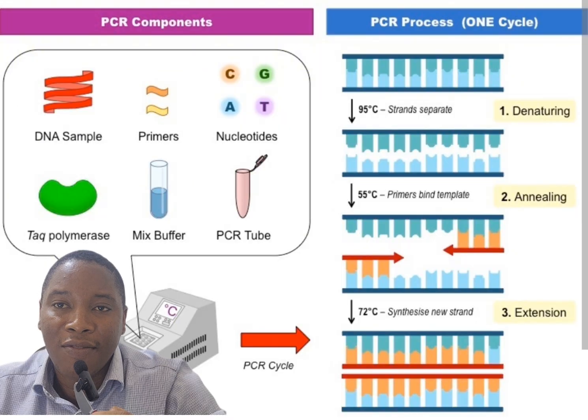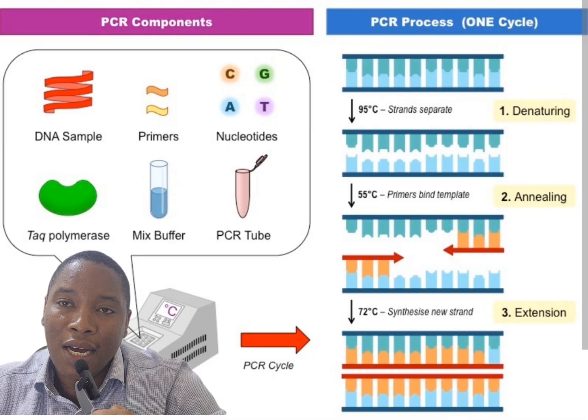primers. Annealing of primers means that we have what we call primers, which are short DNA sequences. And these short DNA sequences are important because they are able to target specific regions. The idea is that a gene has a place where it starts and where it stops along the length of a DNA.